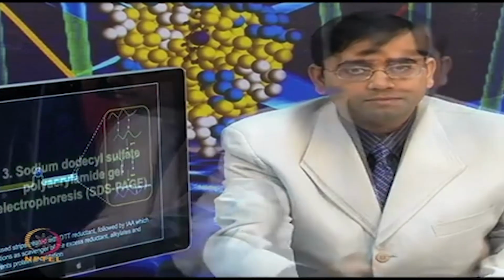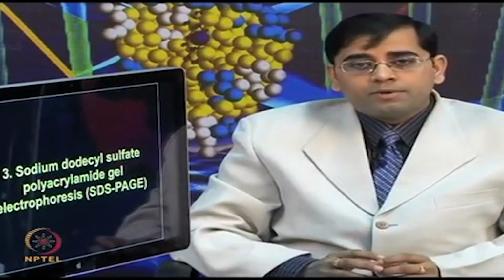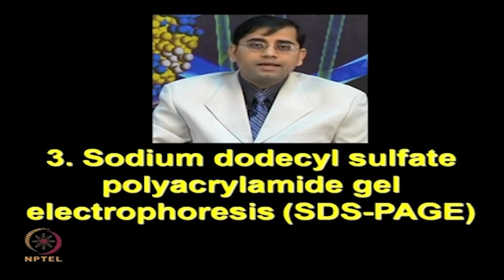So, here you can see how different bonds are broken from the disulfide and IAA is preventing the reoxidation, alkylating these residues. Okay, after having discussed the equilibration step, now we can talk about how to perform sodium dodecyl sulfate polyacrylamide gel electrophoresis or SDS page.